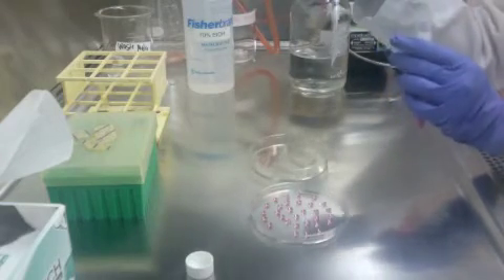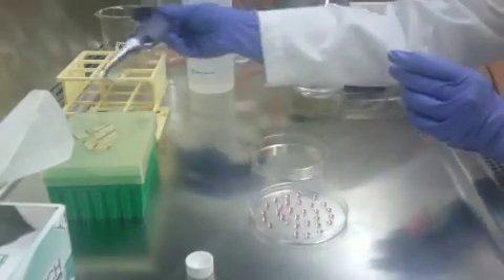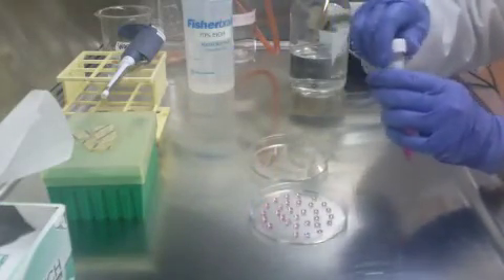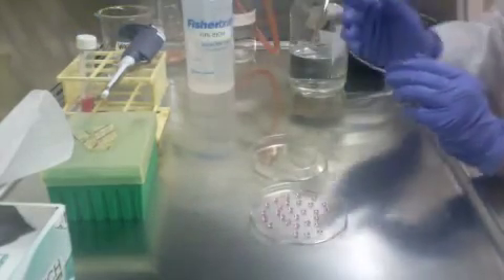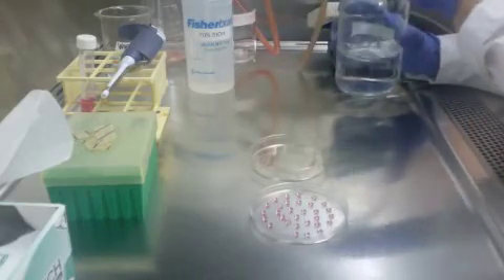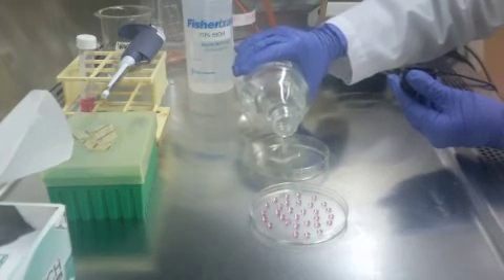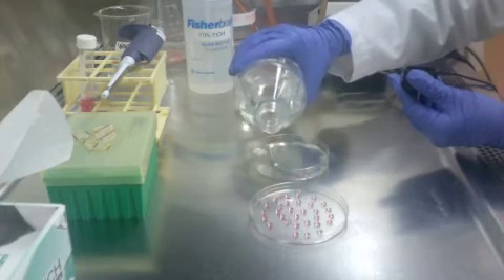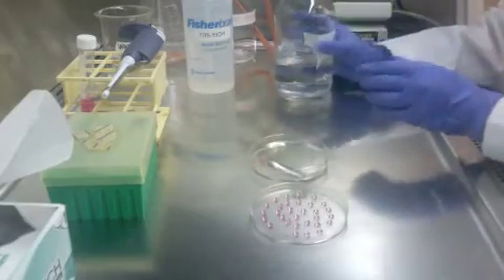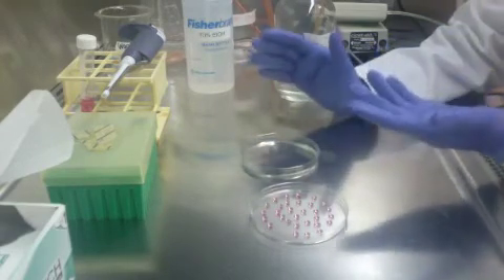Once you're done, dispose of your pipette tip, put your pipette to the side, cover your conical vial, and place it on the test tube filter. Before you close your lid and flip it over, make sure to add PBS to the bottom of your petri dish — just enough to cover the bottom and keep it from drying.